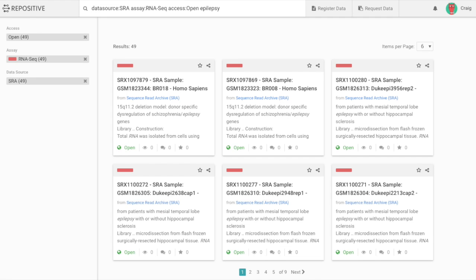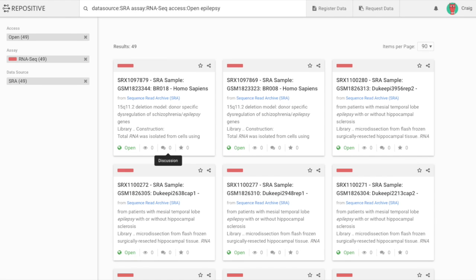So now I have perhaps enough amount of data so I can begin to actually interact with those data sets. I'm now going to make it appear in one page. You can see that we have these dataset cards. You can see where they are open, how many times they have been seen, and any comments from specific people that say, oh, I don't like this, or this is good or bad. In a way, a little bit like TripAdvisor, where you have the reviews of people that tell you, this is a good thing, this is a bad hotel, and so on.